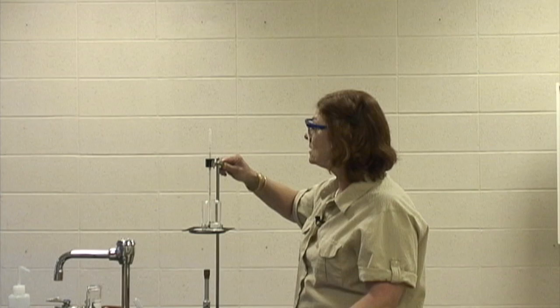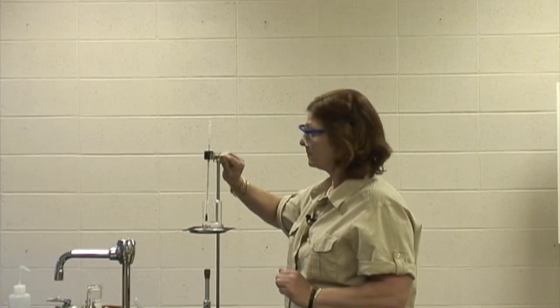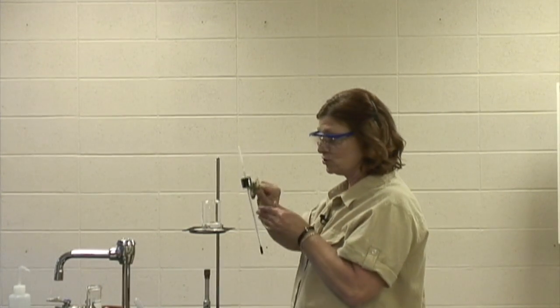And that was a little hint that I'm at a little bit of an elevated altitude. All thermometers are not necessarily extremely accurate, but the consistency is what's important, because the error will cancel and we'll see the trend of what's happening. Well, I'm going to remove this thermometer and I'm going to rinse my solution. I'm going to take the distilled water out.